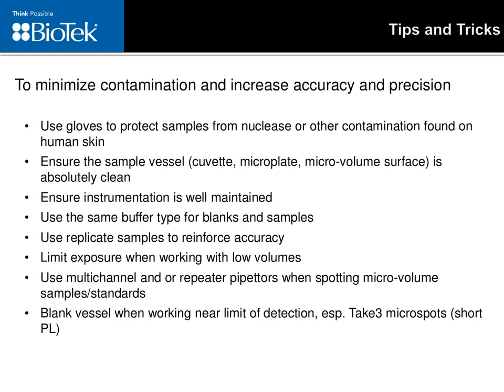Now I'd like to discuss a few tips and tricks to help minimize contamination and increase accuracy and precision regardless of method. It's very important to use gloves to protect samples from nuclease and/or other contamination which may be found in the human skin and can skew our results.